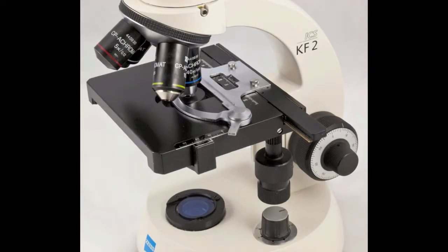In this view, you can observe most of the parts that you will manipulate when looking at specimens on the microscope slides. Here are the objective lenses, which allow viewing at different magnifications.